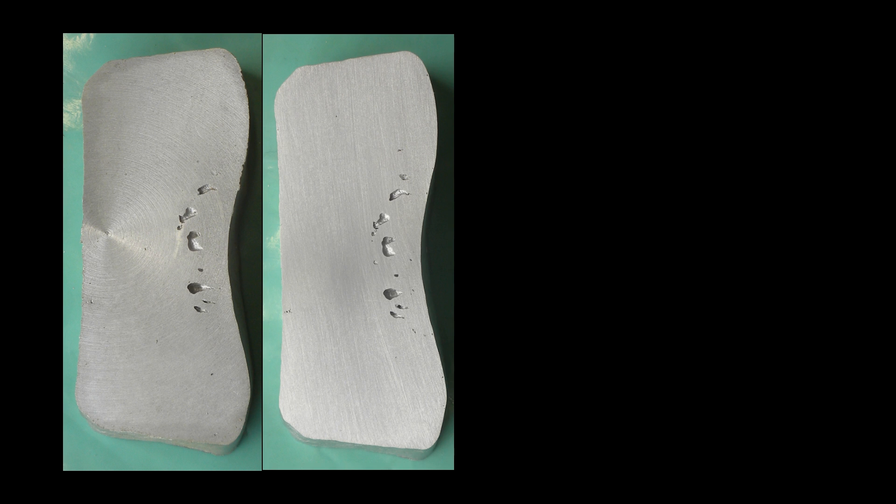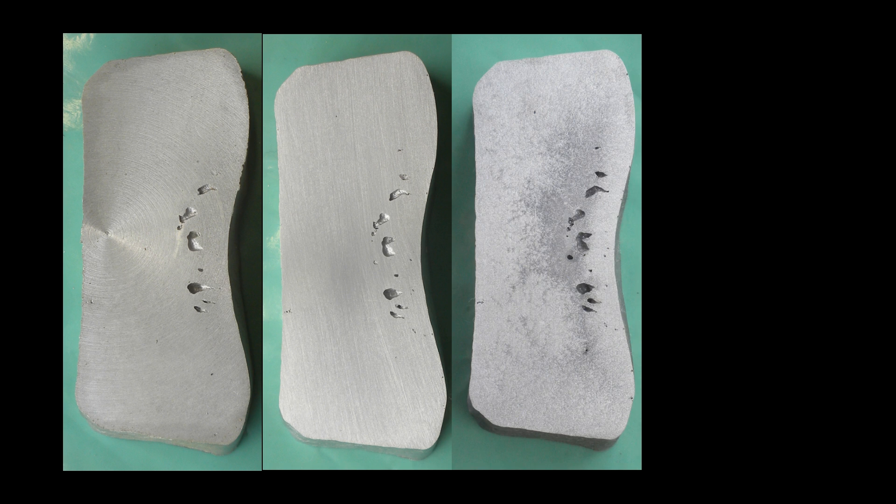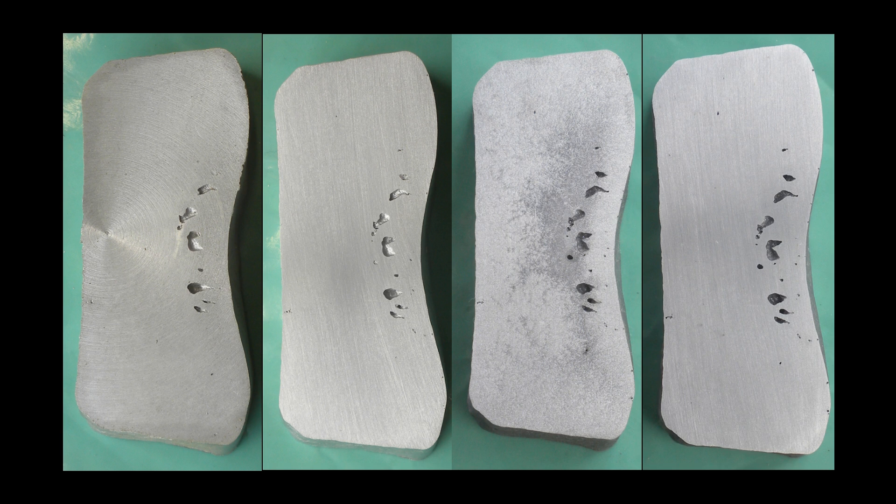Now let's go to the second side of this slice and go through the sequence again. This slice was a bit closer to the centre of the ingot and we've got more gross porosity as a result. First the machined surface. Then the sanded surface. Now again the etched surface. You can see the grey area where solidification has occurred last. Then finally we go to the etched and sanded surface and the porosity now is shown to its maximum extent.